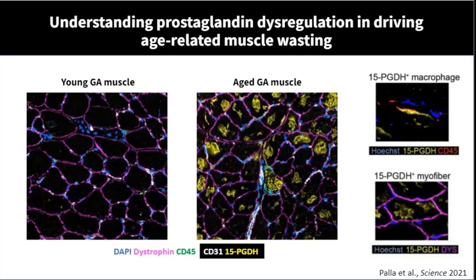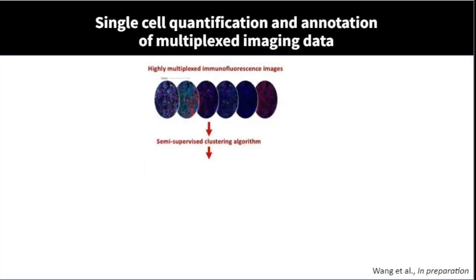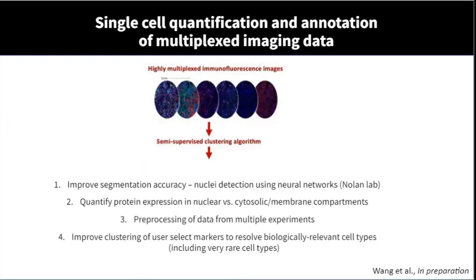Of course, with spatial data and multiplex imaging data, we want to study spatial relationships between cell types. And for that, we must convert the images to single cell data by segmentation, quantification, and clustering. Having better images processed by CRISP is really helping with the quantification, clustering, and segmentation. However, we're also making strides in improving this process. A common question is, how do you know you're clustering the right cell types and annotating them to the right extent? And you've seen from previous data presented by Kai that, with CODEX data, you might not necessarily get the kind of clustering resolution of single cell CITE-seq data or RNA data, which has more dimensionality. So we've tackled this from a couple of different approaches.